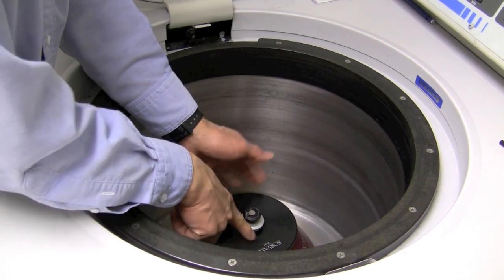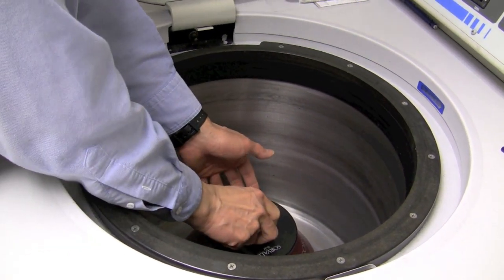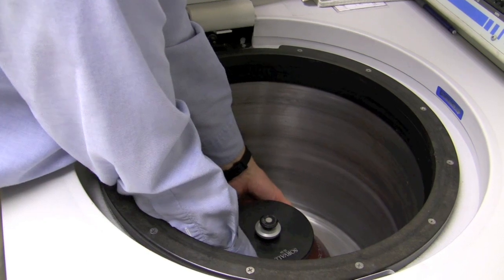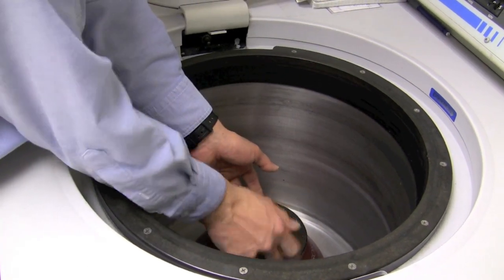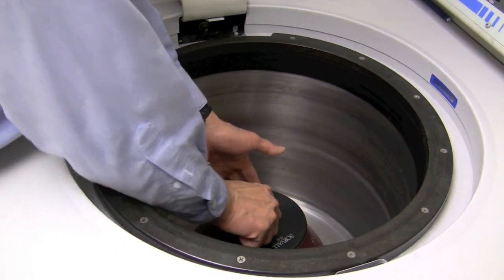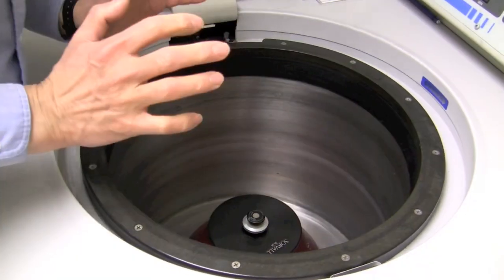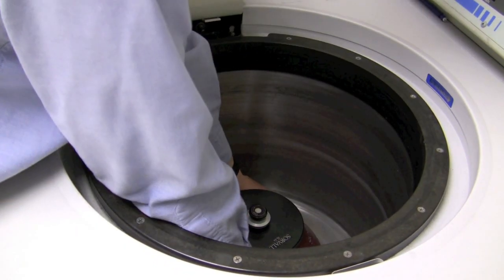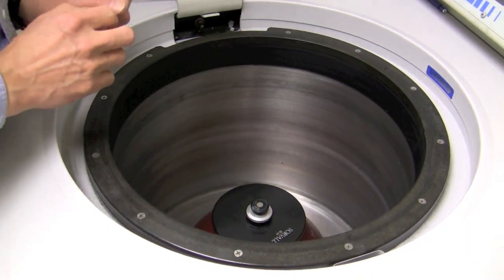That attaches the lid to the rotor, and now the black ring will actually attach the whole assembly to the spindle. And I always check this by taking both hands and lifting up gently to see that it's firmly in place.